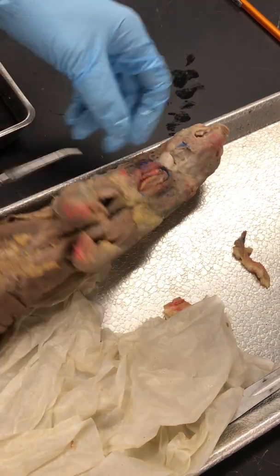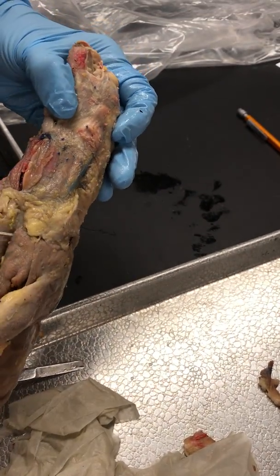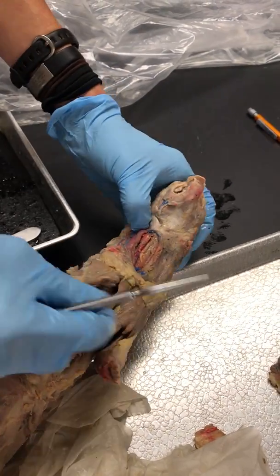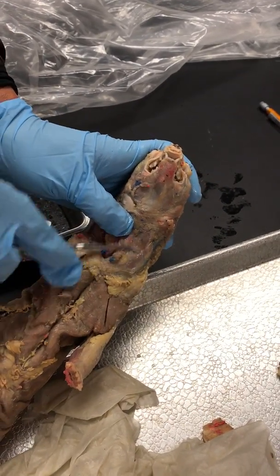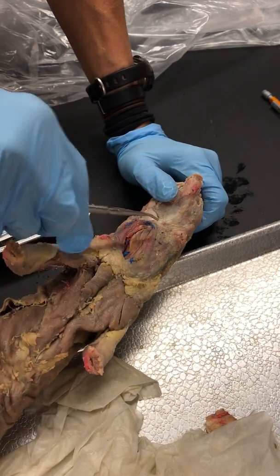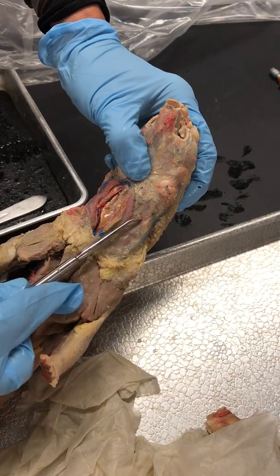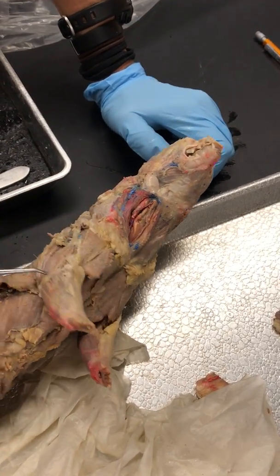And Sternomastoid — the Sternomastoid is going to run down the front of his neck. This hole that they put in there when they prepare them goes right through the Sternomastoid, but you can still see that muscle. There's a piece on this side and a piece on this side, so they kind of cut through that one, but you can still see it.